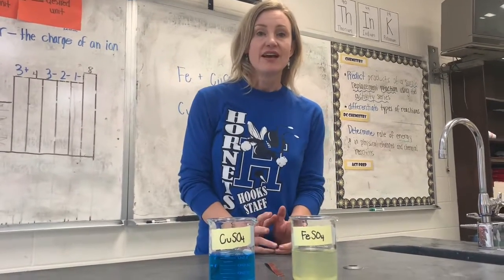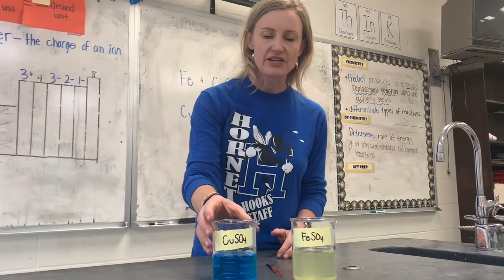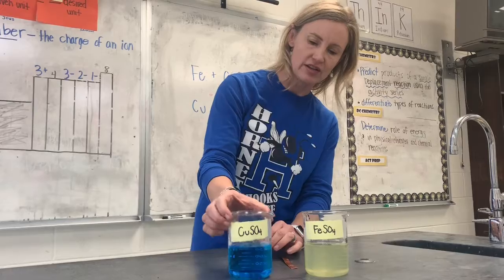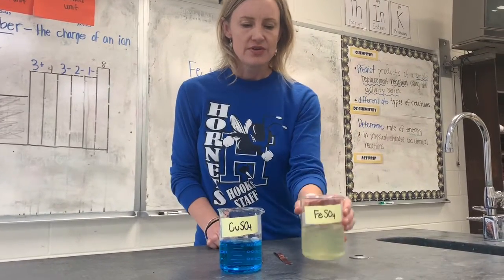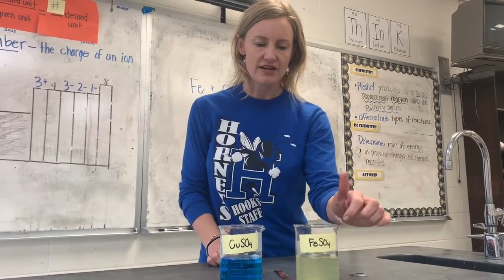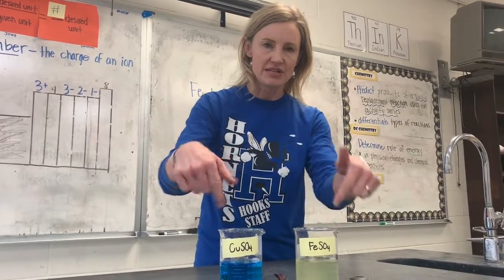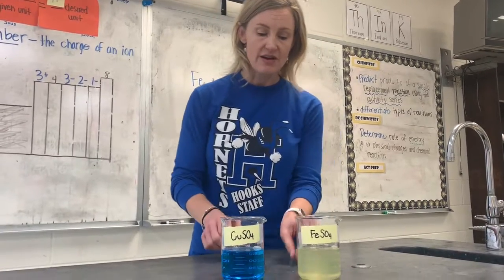This week's lesson. What I'm starting with is a solution of copper sulfate. I love this solution. I think it's a beautiful color. Anyway, there's copper sulfate. This is iron sulfate. If you remember, this is an ionic compound, so you've got an iron ion and a sulfate ion. This is a copper ion and a sulfate ion, and I've mixed them with water, so those are in there.